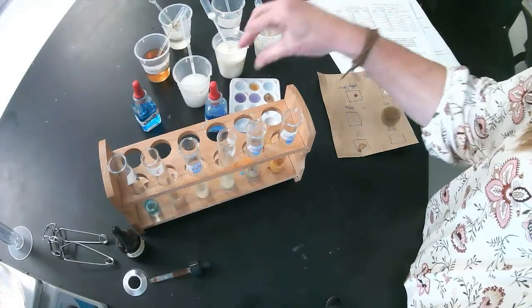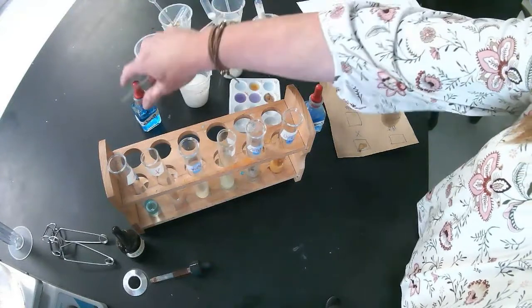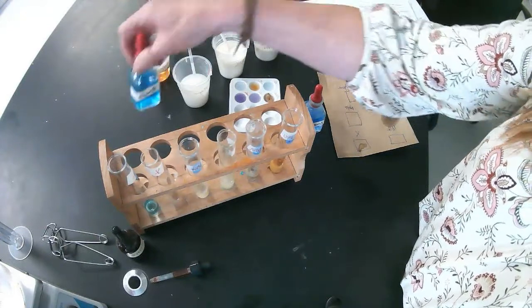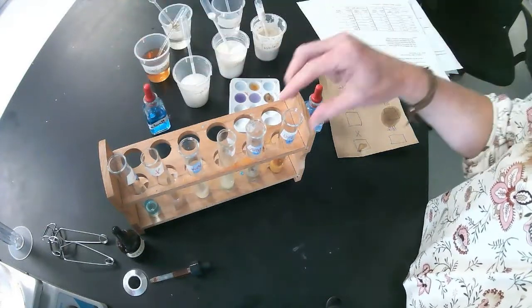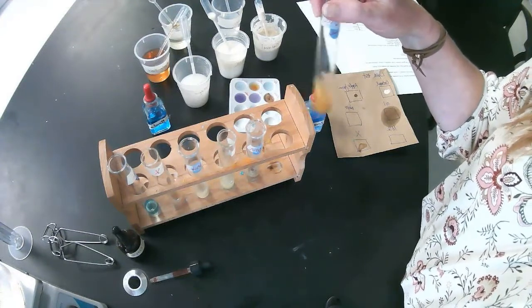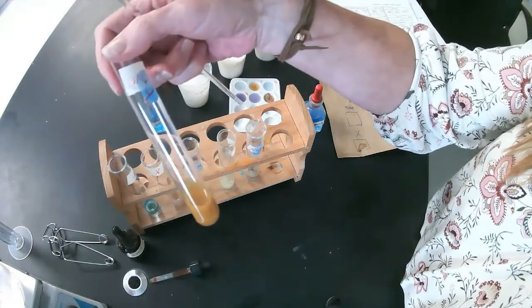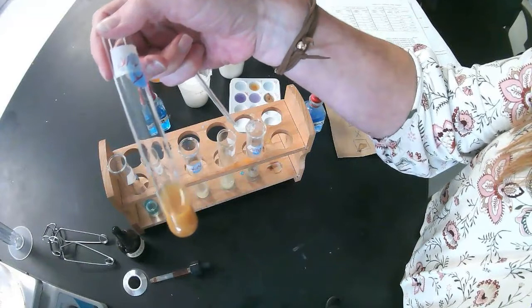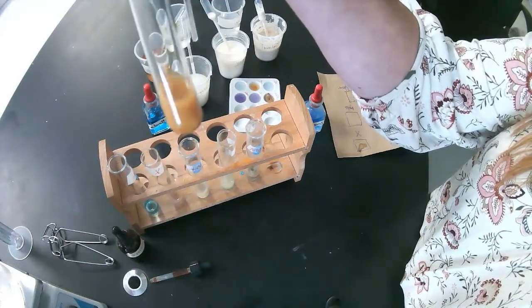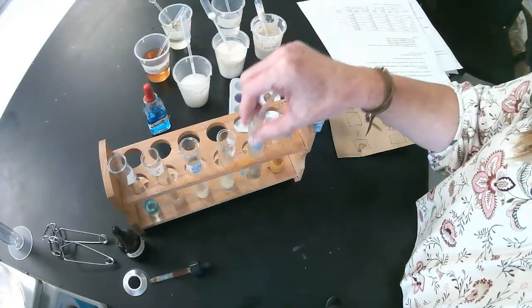Okay, and then we added 20 drops, whoa, not biuret, of the Benedict's. And this is gonna check for simple carbohydrates, simple sugars, okay? And it goes from the blue control. If there are simple sugars present, you'll get a bright orange color. So let's take a look. This is the apple juice, turned bright, yellowish orange. So I'm gonna call that a positive for simple sugars, okay?